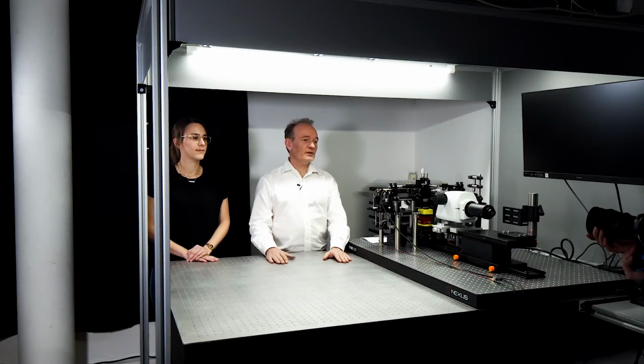We have prepared an optical table for you. Actually, you can put the microscope on any table you want, except you need to be able to darken the room a little bit, but an optical table is not required. You can put it on a wet bench, even on your office desk, if it's dark enough, actually.